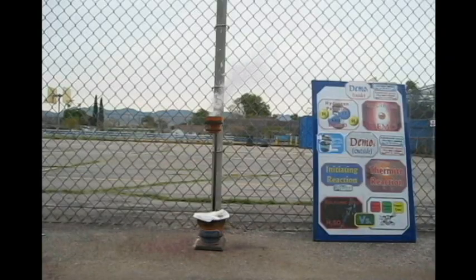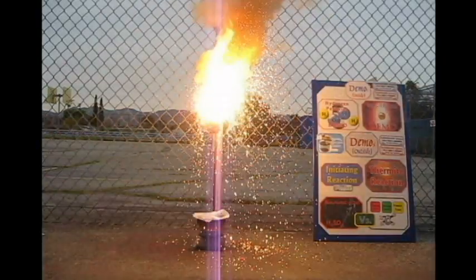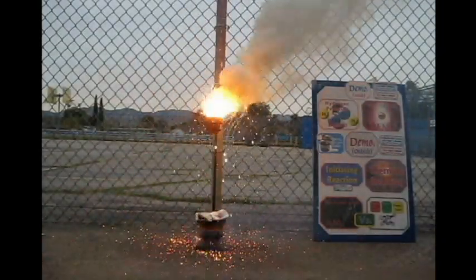Let's see, hopefully this will happen. We want to see a really strong one — we want to see a really strong reaction starting. Come on, come on, come on. More than that, way more than this. There we go — that's what we want. There we go. Watch the bottom, watch the bottom.